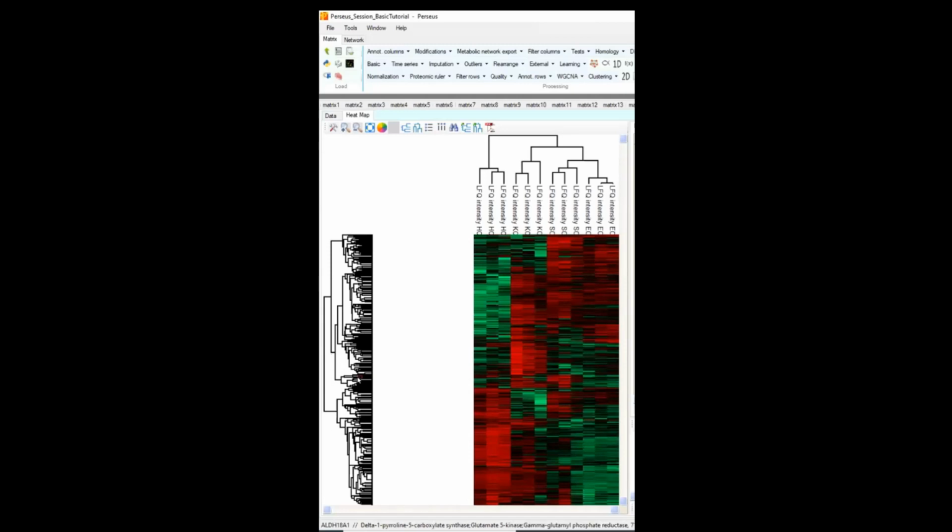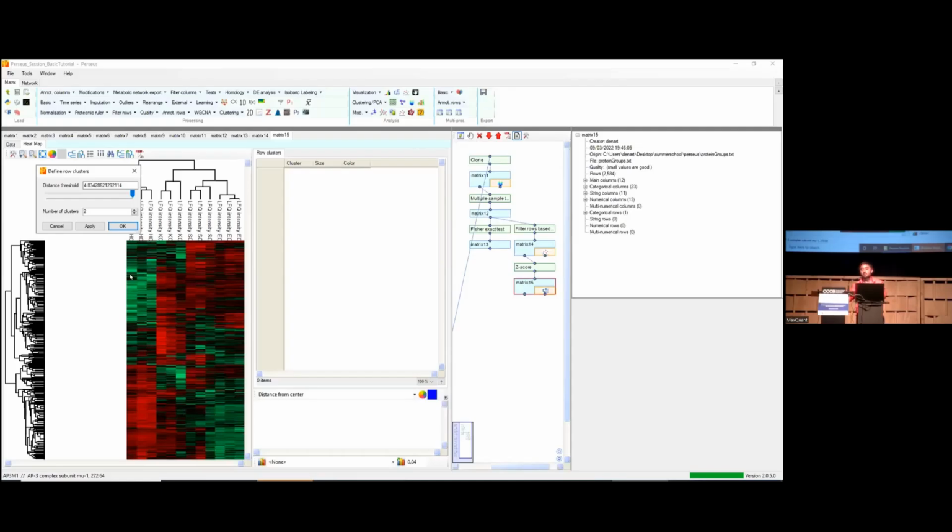I actually want to ask you if you have any idea what this would be useful for. Actually, a more concrete question: here you can define a number of clusters for the proteins. Which number should I set here and why? Does someone have an idea? Either what they mean, or which number of clusters I should choose? If I set it to 4, what do you expect? 4 groups. And what will this group mean in terms of behavior? Behavior. Yeah, in a way.